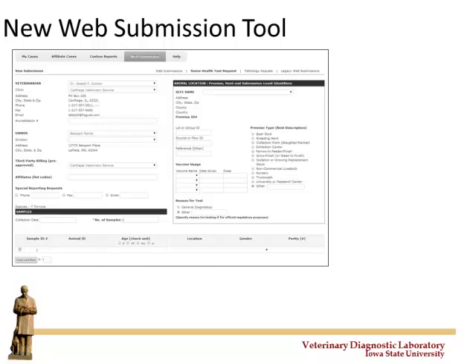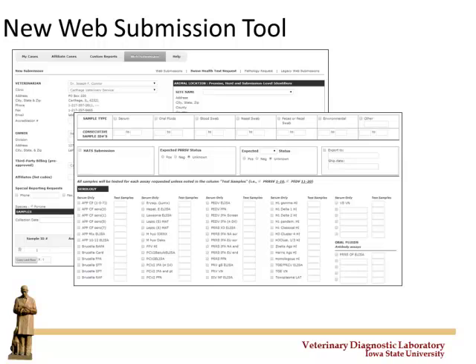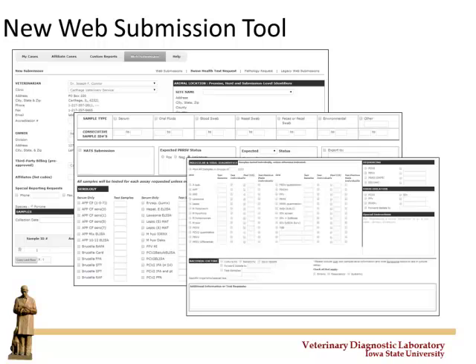And then over time, the site information that the submitter is seeing here, if they're using the web submission tool, is the exact same tables that our clerical staff is seeing if they're getting it in on paper. So there'll be a way, kind of a QA/QC over time, of: these sites went away, we got new sites, we need to add them, all that going forward. Okay? And the test selection tools and so on look the same.